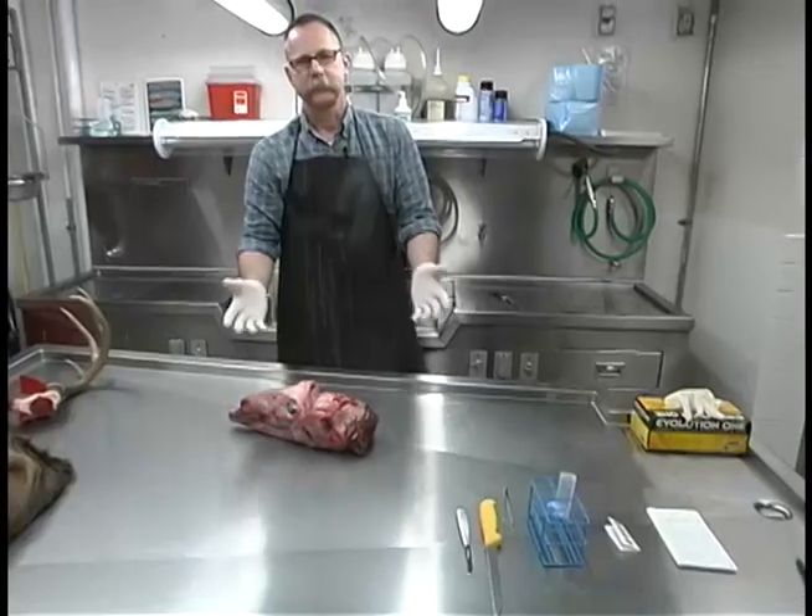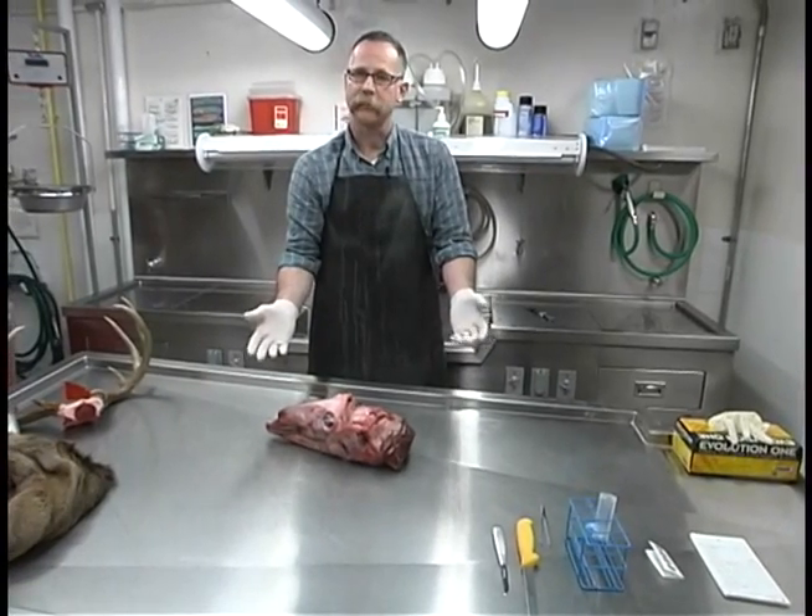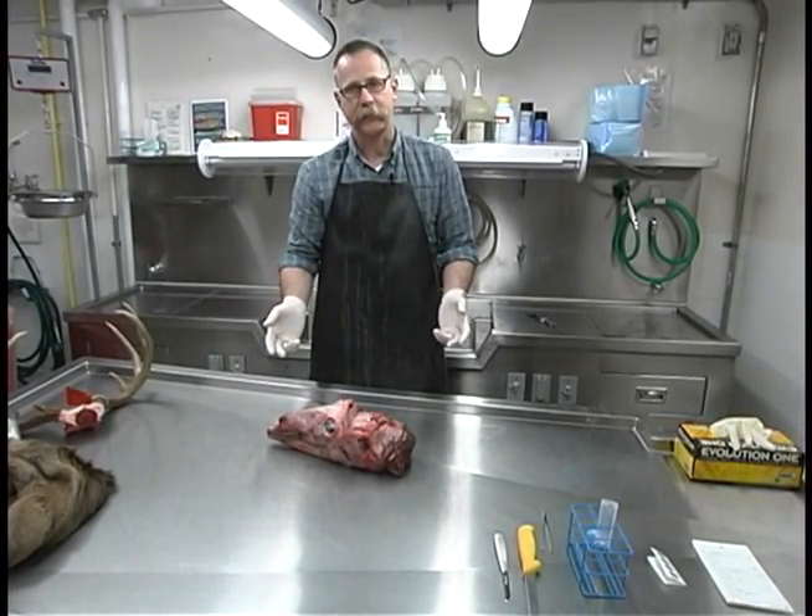You'll also need the New York State DEC deer kill report form. In addition, at a minimum you should wear latex gloves and a rubber apron to protect your hands and clothing.